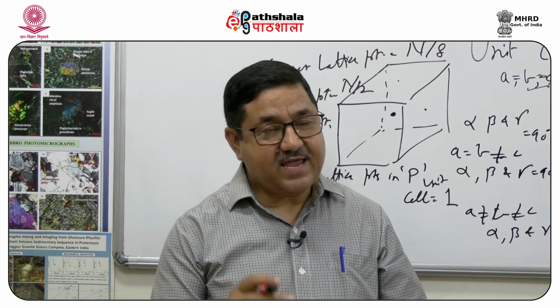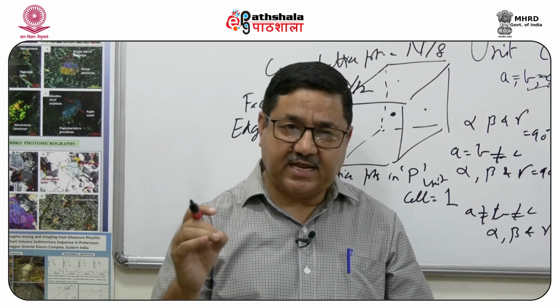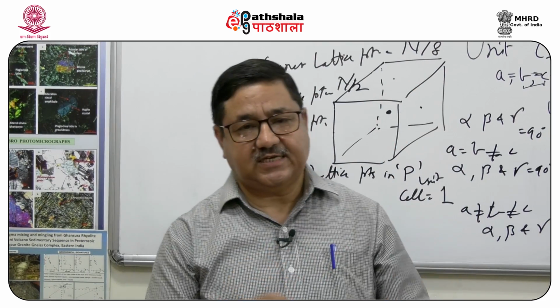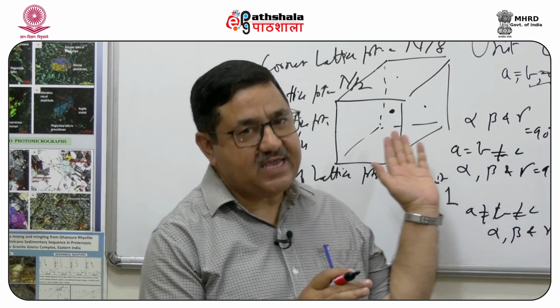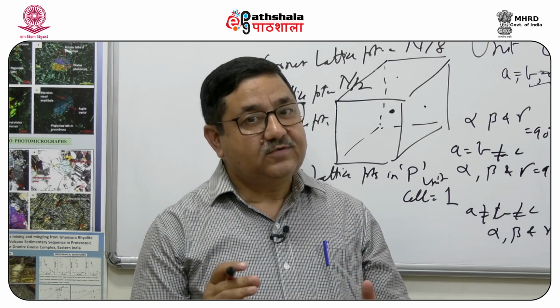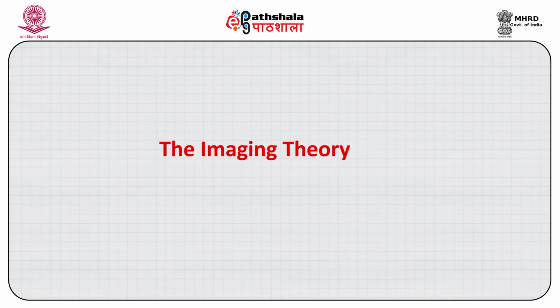So, prior to understanding X-ray diffraction, where we are using an X-ray to image this crystalline structure, we will have to understand what is the relationship of the image which is produced by an X-ray to the real lattice. The analogy of X-ray diffraction can be understood in terms of image formation described by Abbe theory, which considers that any object scatters the incident light by diffraction.